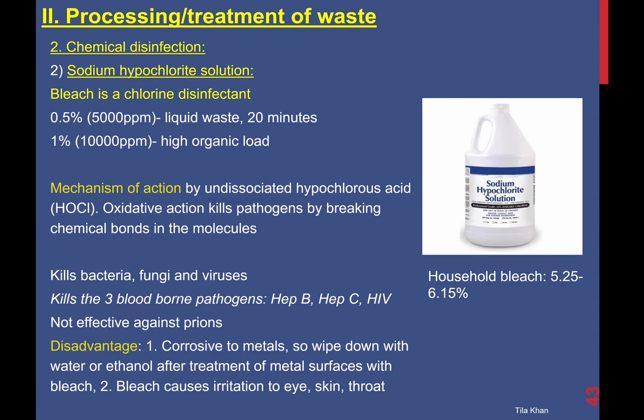It kills everything, and for liquid wastes we use around 5,000 parts per million, around 0.5%, and the contact time is 20 minutes. Please make sure. And if there is a high organic load in the waste, then please use 1% or 10,000 parts per million. The mechanism of action of bleach is through being a chlorine disinfectant.